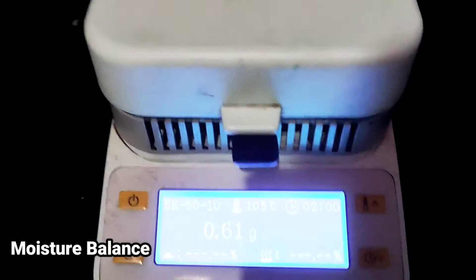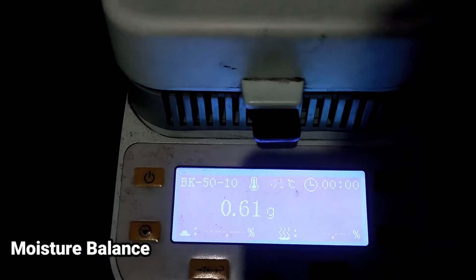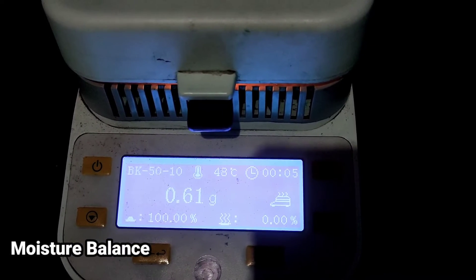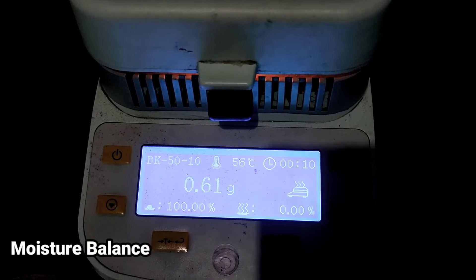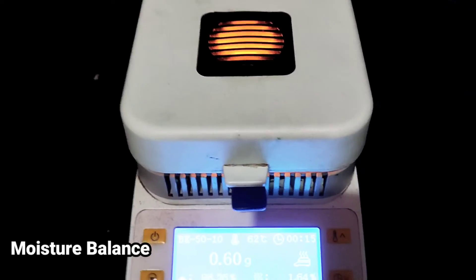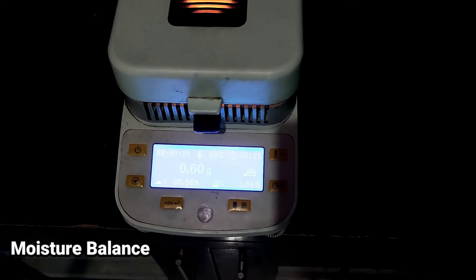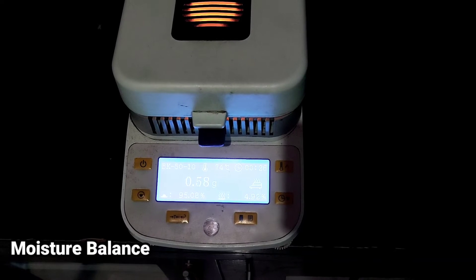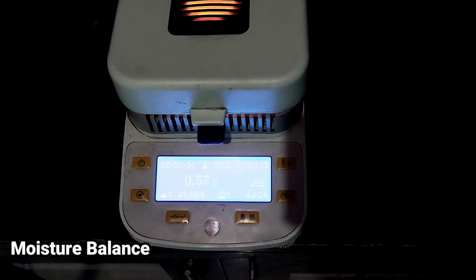Kita luruskan. Jika sudah, kita tekan Mulai. Suhu yang kita atur akan naik secara otomatis sampai pengaturan 105 derajat. Setelah suhu mencapai 105 derajat, dia akan stop atau mati otomatis dalam waktu 2 menit, dengan ditandai bunyi alarm.